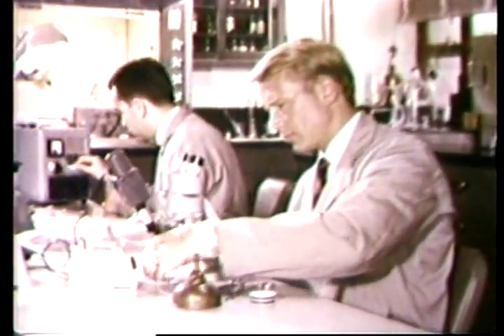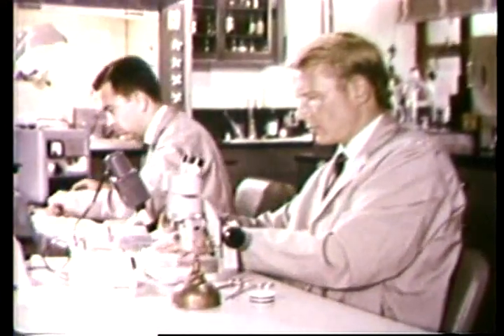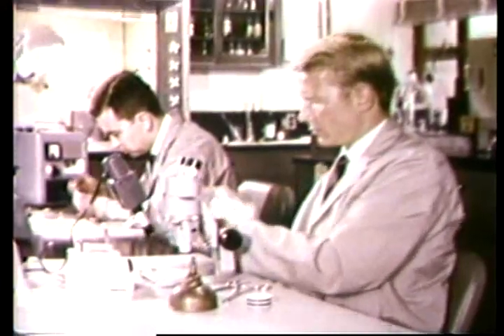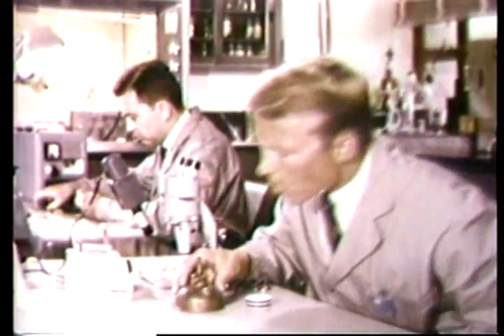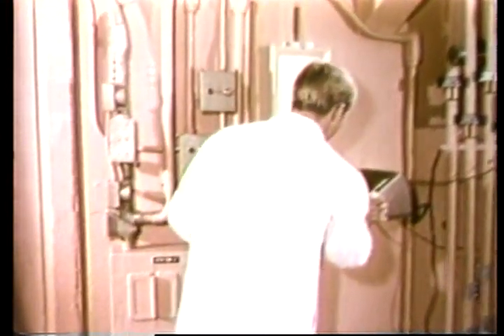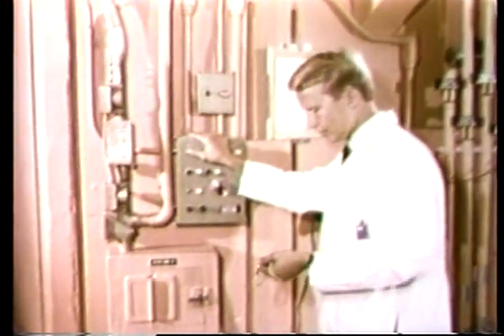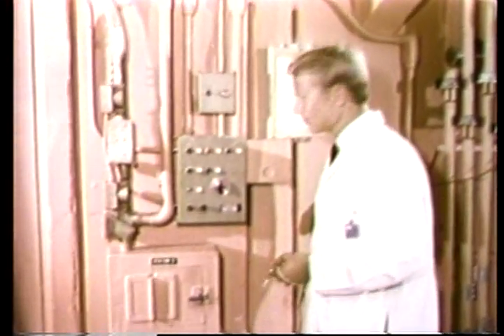Another examiner has been separating and isolating microscopic particles from a paraffin cast removed from the hand of a suspected gunman. These small particles will be made radioactive in the reactor and the elements comprising these particles will be determined. The nuclear reactor has a system of pneumatic tubes that can carry encapsulated small samples directly to the core. It is monitored, like every phase of reactor operations, through the central control room. The FBI examiner has placed his microscopic samples into a small container called a rabbit and inserts it into the pneumatic tube system.